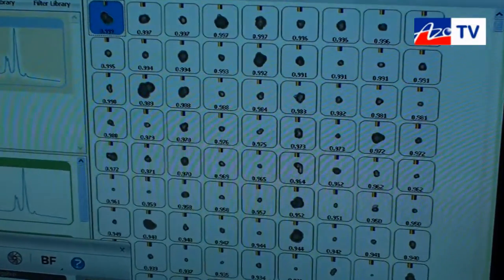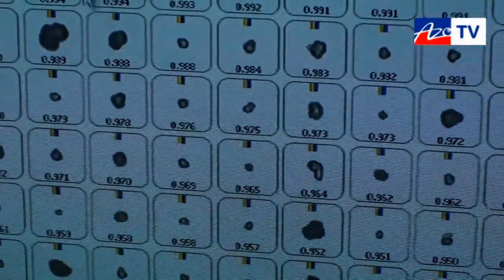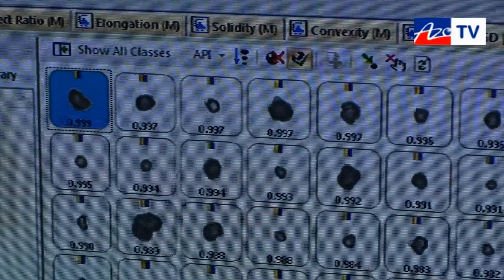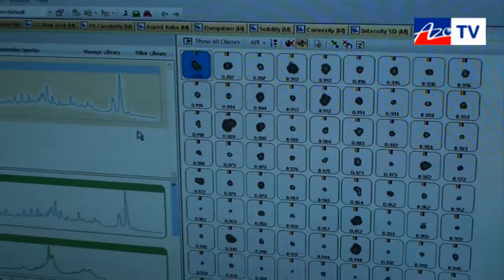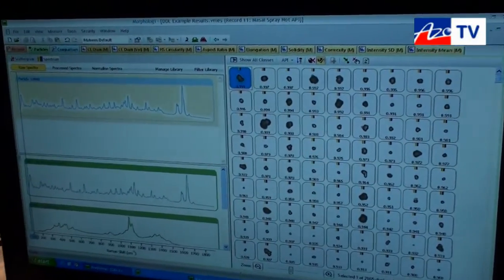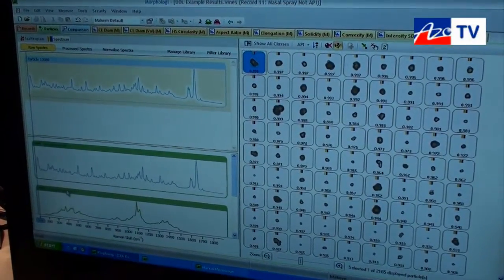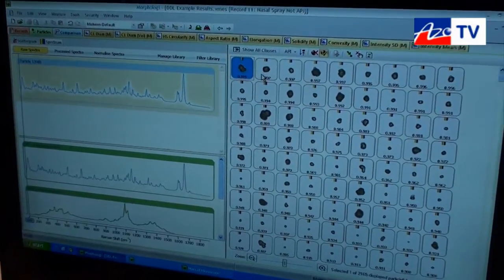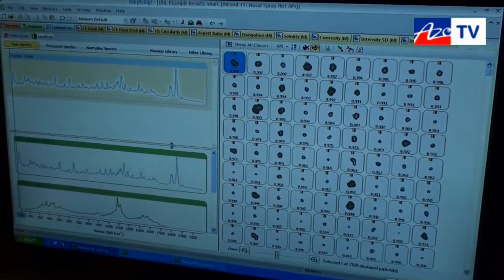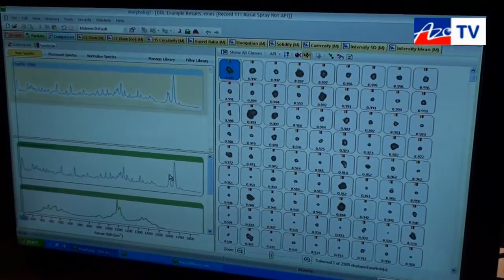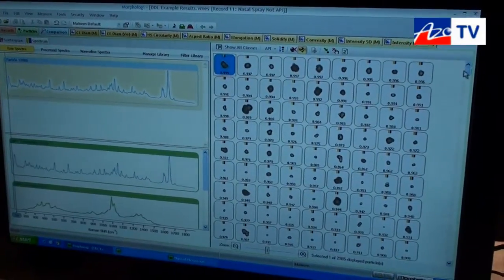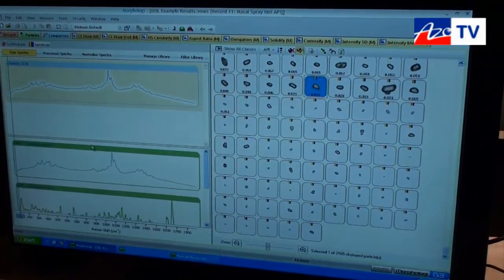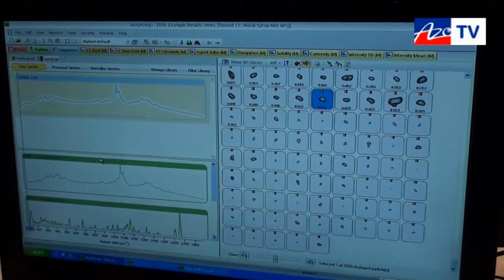After the fact, we can have the instrument go back and take a series of Raman spectra. Those Raman spectra are indicated by the little prism-looking color bar here. Each one of these particles has a Raman spectrum associated with it. We've built a couple of different things into a library here corresponding to the active pharmaceutical ingredient and to microcrystalline cellulose. Once the software has identified each particle and taken a spectrum of it, it correlates versus this library to give an exact identification. We can see that each one of these particles is an API because the spectra match, and if we scroll down we can see where there's a lower correlation where the spectrum is much more similar to MCC. So we know unequivocally that we've identified these particles as being either API or microcrystalline cellulose.